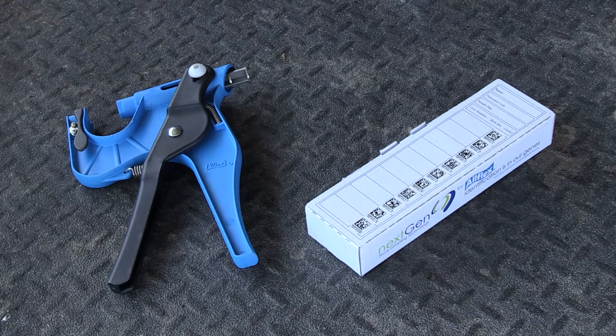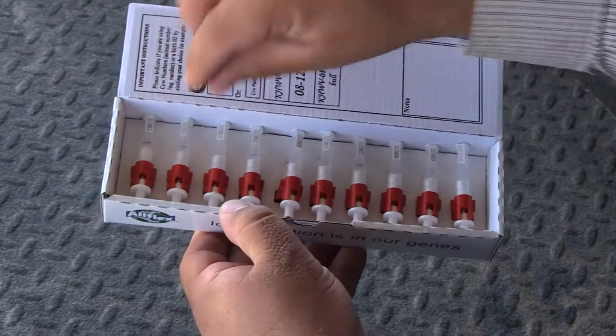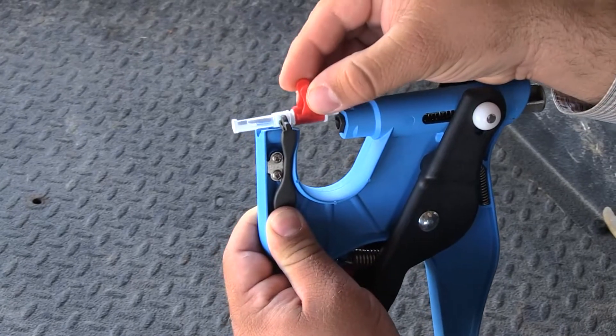The TSU is a simple unit that collects the sample and stores it. It's a one-piece unit and you need an applicator specific to that unit. You'll load the tag in the applicator.